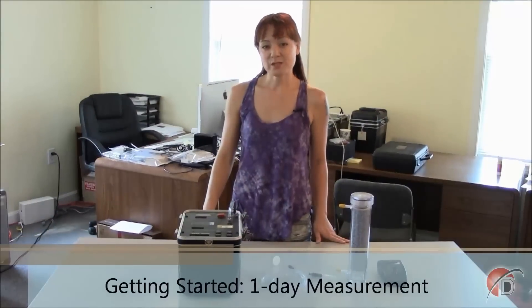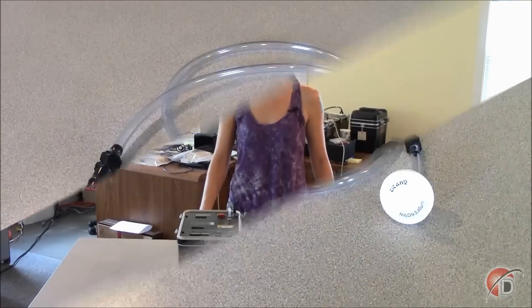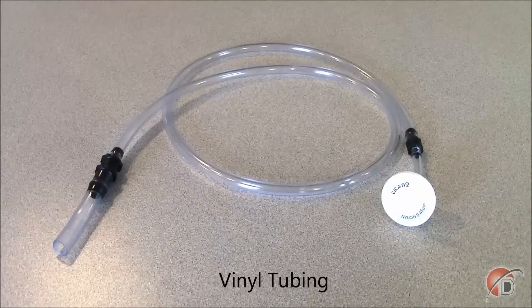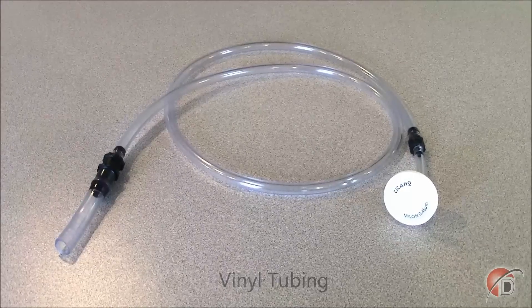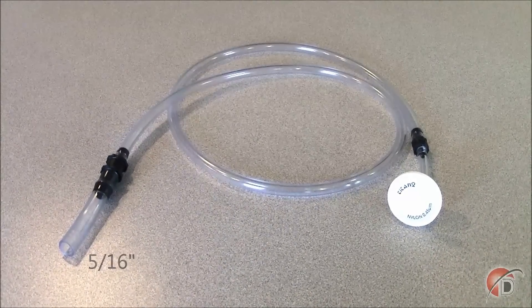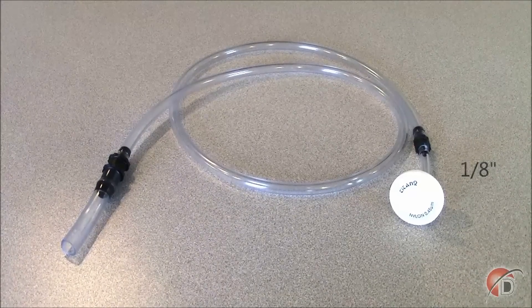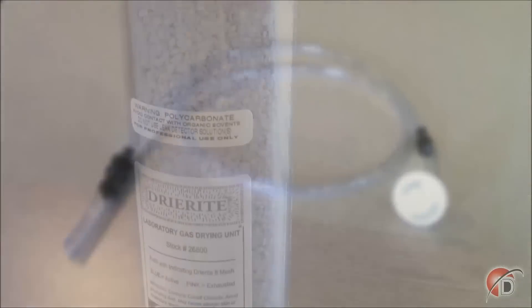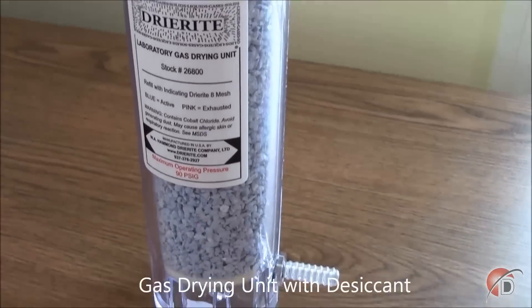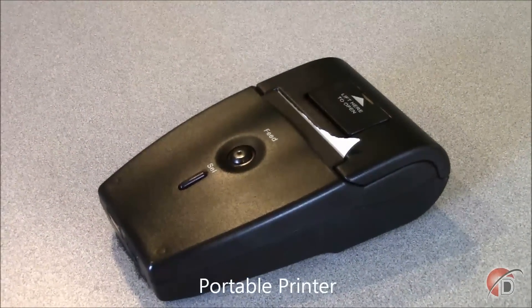Before you begin your test, you want to make sure that you have all of the equipment you need. For this application of the RAD7, you'll need the following RAD7 accessories in addition to the RAD7 itself. The first item you will need is a three-foot-long piece of vinyl tubing with adapters. Be sure to pick up tubing that has one large 5/16-inch segment for connection to the laboratory desiccant, and one small 1/8-inch segment with an inlet filter for connection to the inlet port of the RAD7. You'll need your laboratory desiccant.